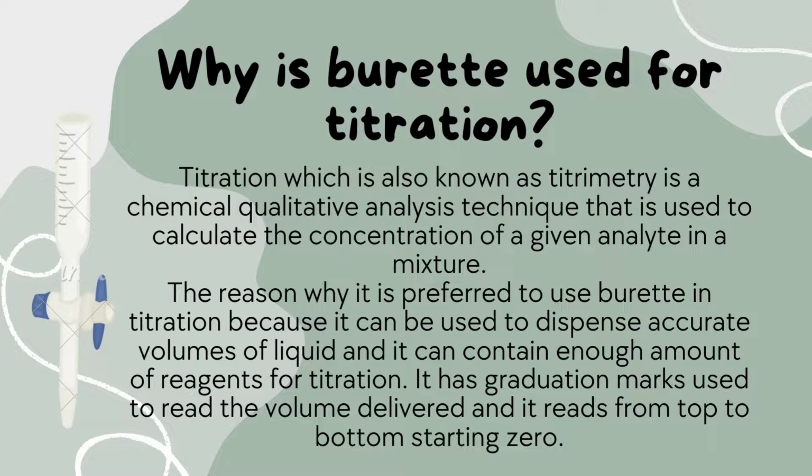Do you know? Why is a burette used for titration? Before we answer, let's understand titration.